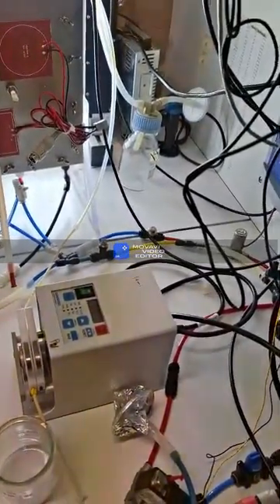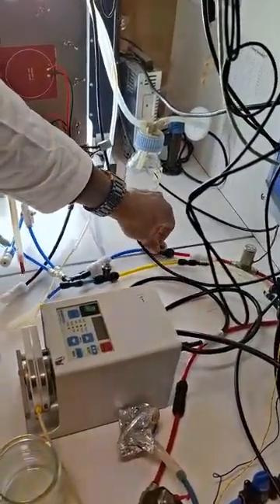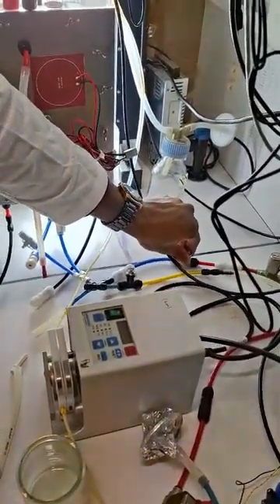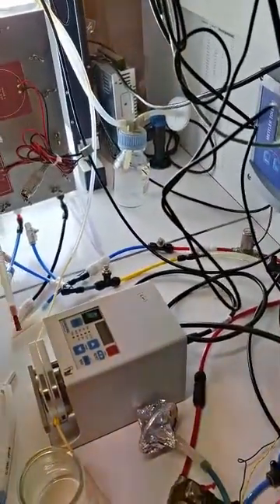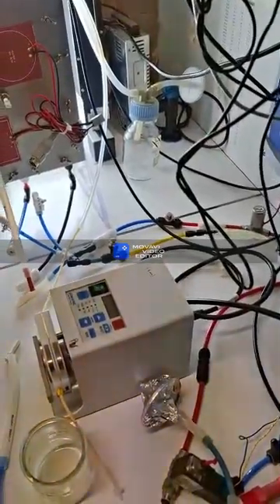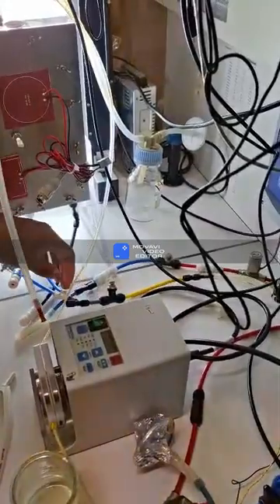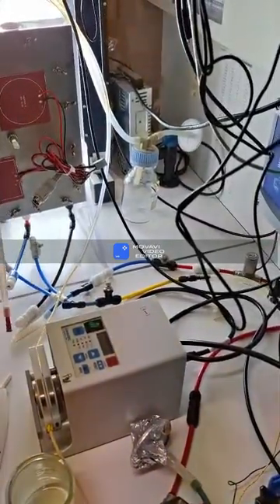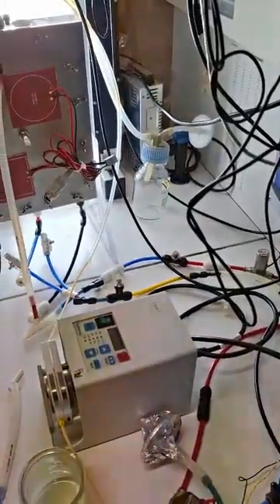And here you have to open this slowly, because you will not have to inject too much carbonic gas. It means physically we can fill by this valve, but chemically we can regulate by using the probe. Yeah, okay.